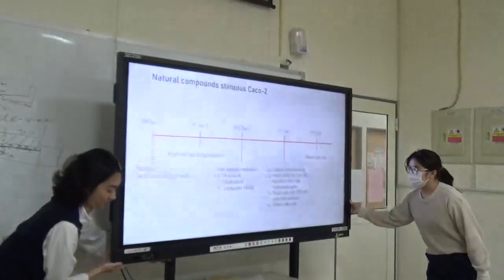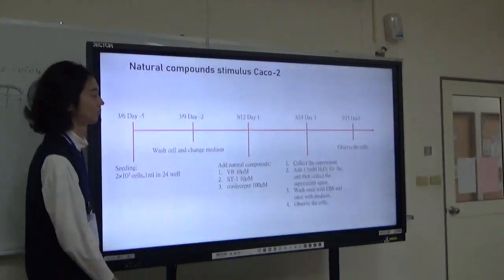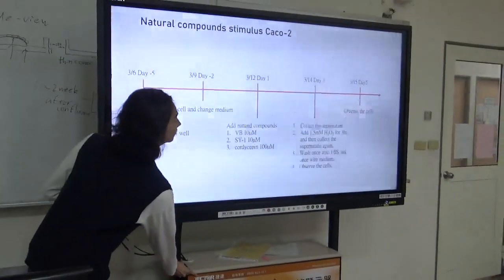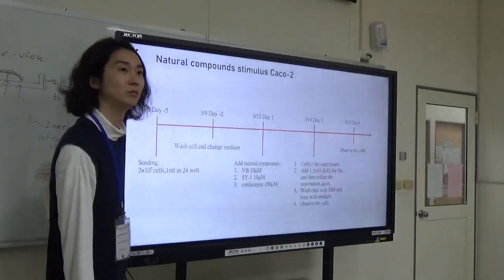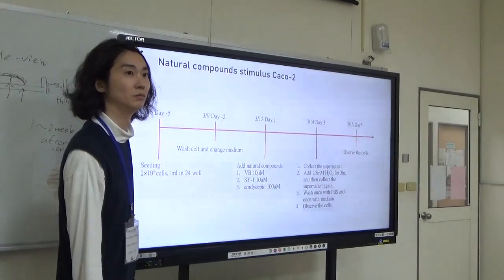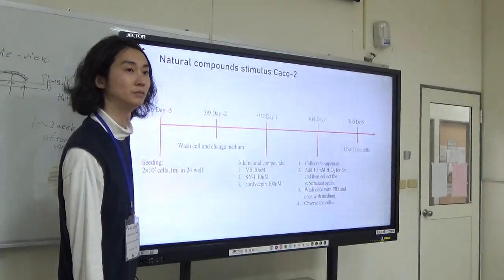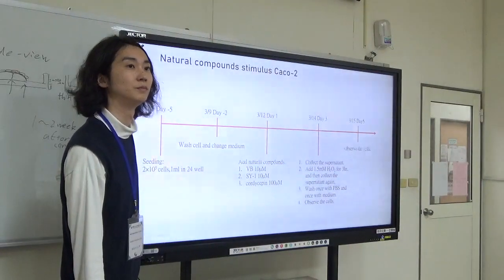Because my students say it is very simple to observe the cell density and condition. If they say almost 90% or 100% of cells are alive, they say it's okay.